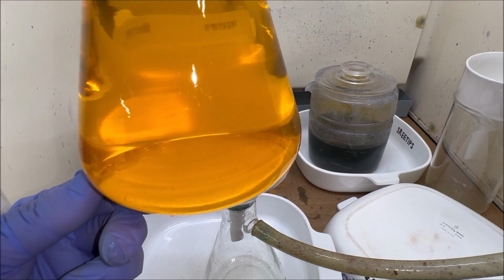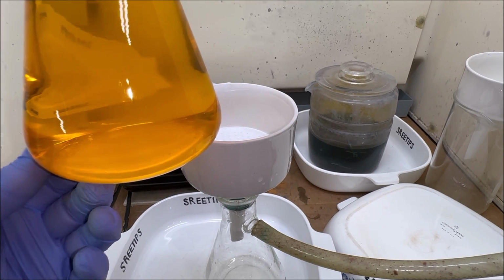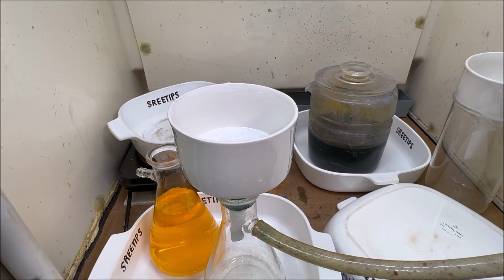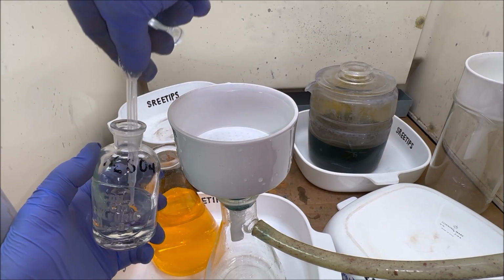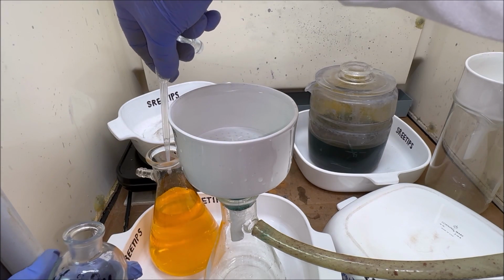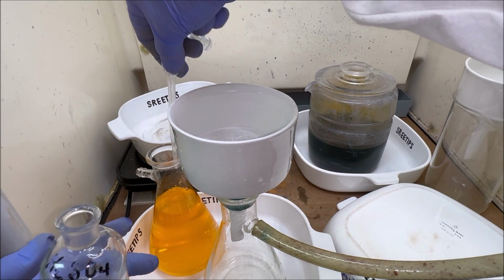Yeah, there's some precipitate that's settled out down on the bottom. Probably some more lead sulfate. You know what? Let's do this before we proceed here. I'm going to put another little squirt of sulfuric in here, see if we get any more precipitate to form by adding some fresh sulfuric acid.